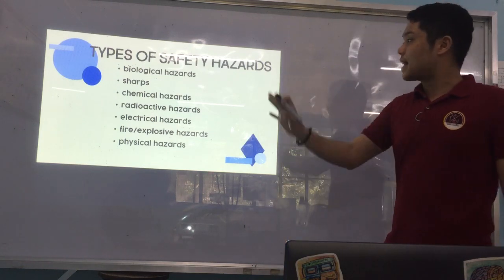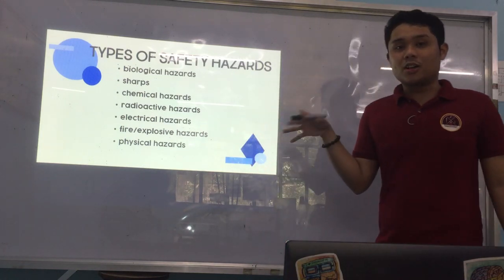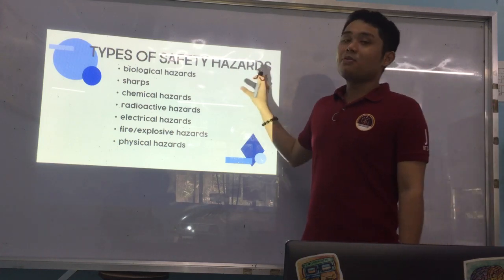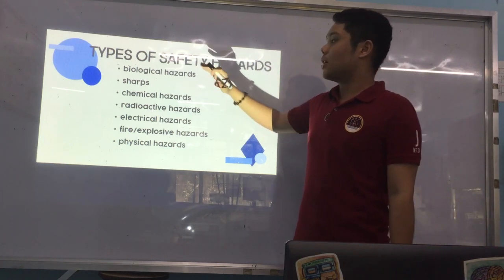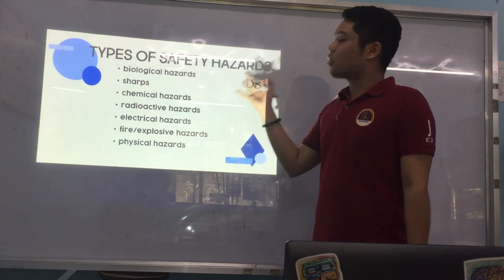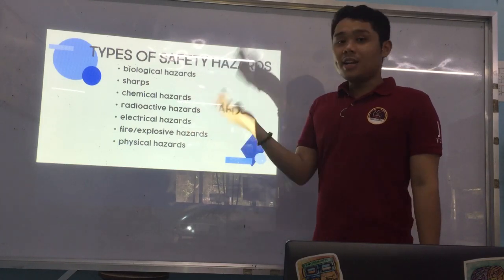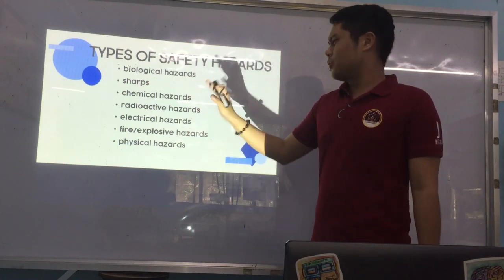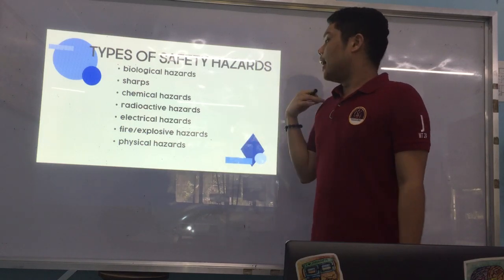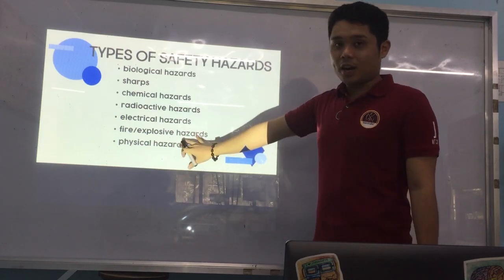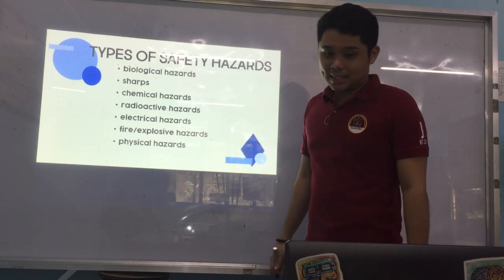We'll now proceed to the different types of safety hazards that can be found in the laboratory. First, we have biological hazards. Next, you have sharps, chemical hazards, radioactive hazards — which are usually not common in our routine clinical lab — electrical hazards, fire or explosive hazards, and physical hazards.